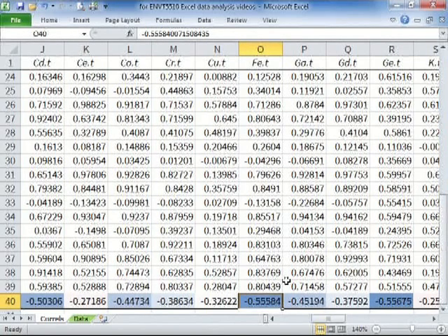We've got iron in there, a major element known to affect the chemistry of trace elements in soils and similar materials, and it's suggesting that we have a negative relationship between the proportion of zinc extractable by DTPA and iron.